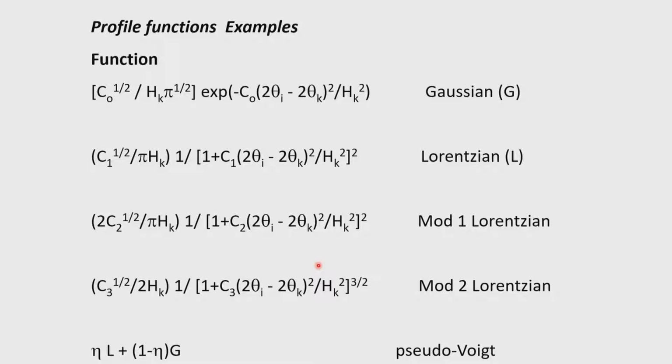The instrument determines the profile function which we normally adopt. So for a routine powder diffractogram which we get from machines like Panalytical or Bruker, we normally use a pseudo-Voigt function for the profile fit. Just remember that. I don't think it is particularly important.